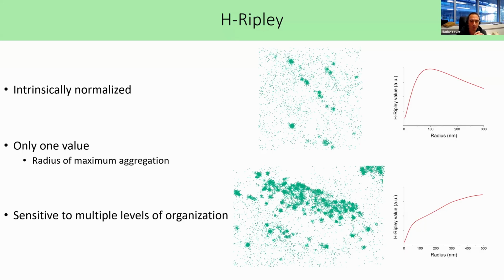So basically, usually people are not using it on the whole dataset, but on some ROI where there are two levels of organization, basically background and clusters. Even if the method is really without bias, because you don't give any threshold, it's statistical and robust, you still have some bias because you will do it on some ROI that you choose.